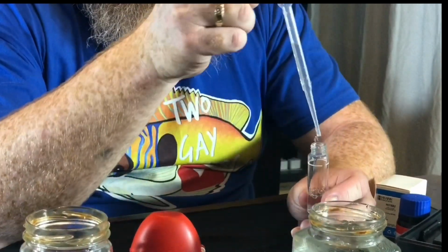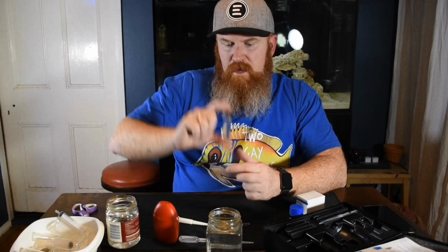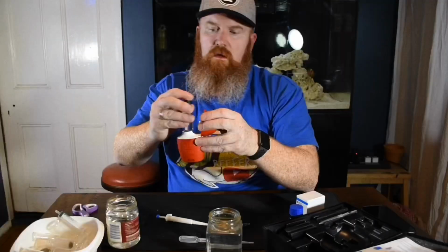All right, you grab your little pipette thing, and you're filling it up with RO water, and you want to fill it up to the 10 mil mark again, like the other ones. All right. Give it a shake for about 15 seconds or so. Make sure there's no major bubbles. It says C1 on the front of the checker. Pop it in and wait.